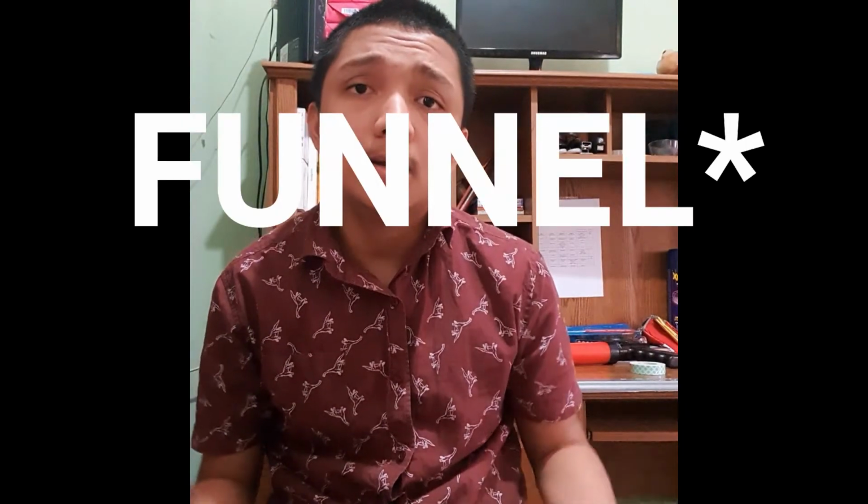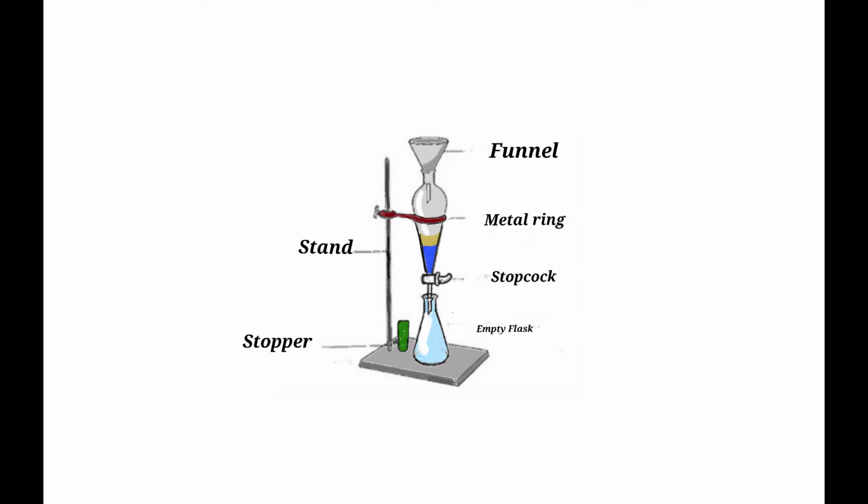A separation funnel is a glassware apparatus used in labs for separating two immiscible liquids. Liquids that do not dissolve into each other are immiscible. It features a large and rounded top with an opening and a narrow base with an aperture, equipped with a mechanism that features a close and open dynamic.